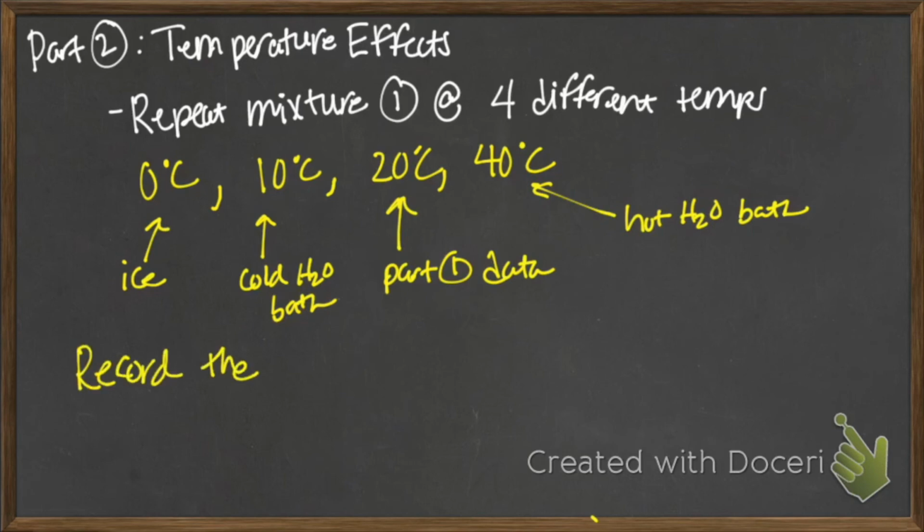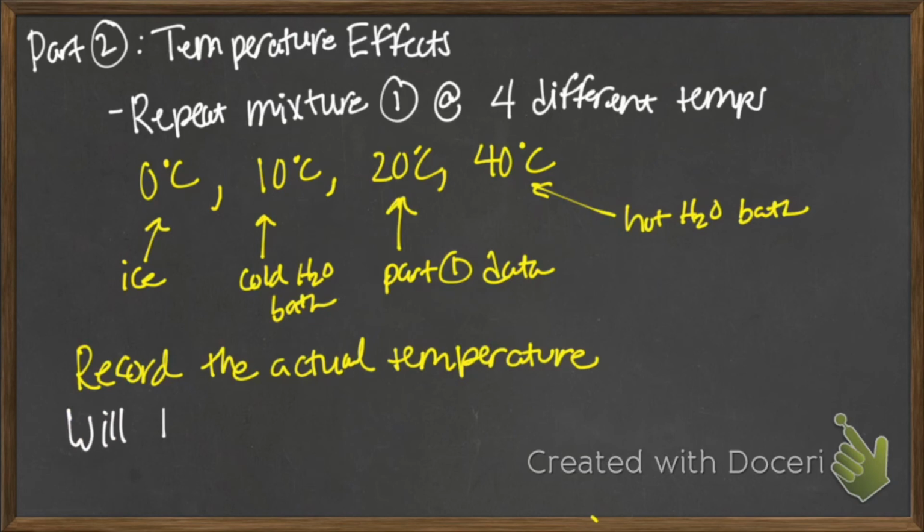So we'll record the actual temperature. So it might not actually be 0, it might be 1 degrees or 2 degrees, 10 might be 9 or 11, so on and so forth. So we will actually record the temperatures of the solution.